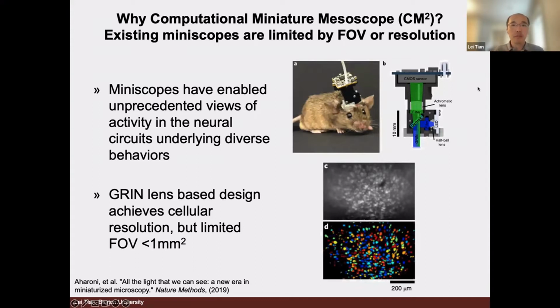The Miniscope has been developed for several years. Over the years, collectively as a community, we realized that there are still some limitations. Primarily, the main limitation of the Miniscope is the optical design. In particular, the optical design limits the field of view one can image.